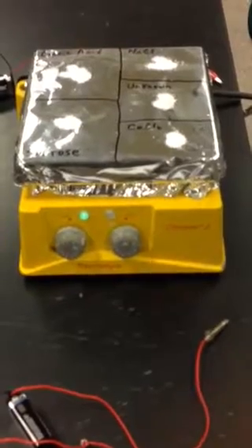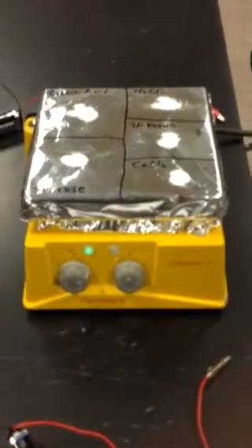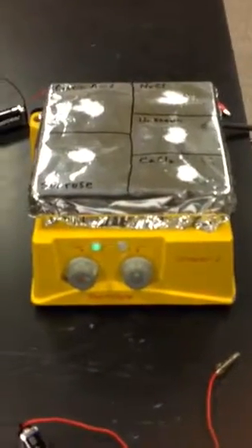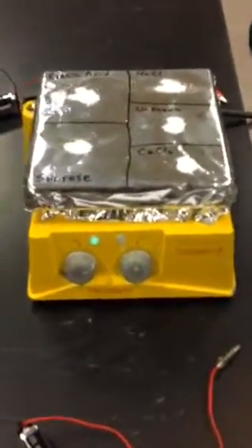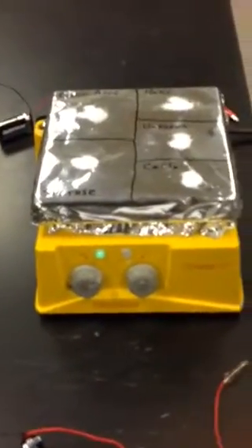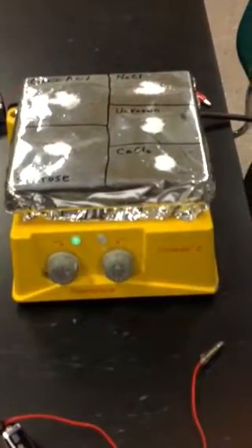Well, I smell something happening now. My description is white. Yeah, I wouldn't recommend using your description to be it's white. Okay? I would say that you probably want to have a little bit better detail than white. Oh, I smell something happening, but I don't know whether that's something that was previously on the hot plate. Well, I see something happening too.